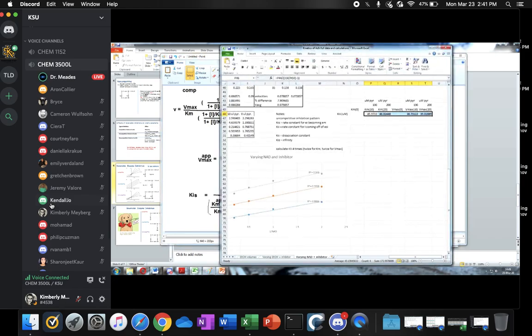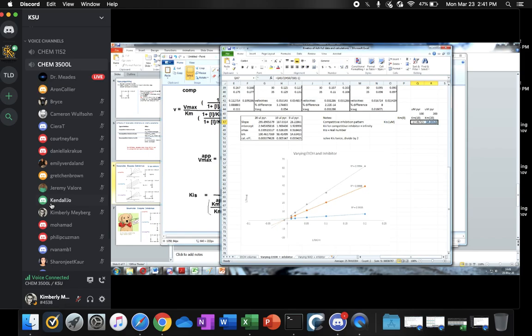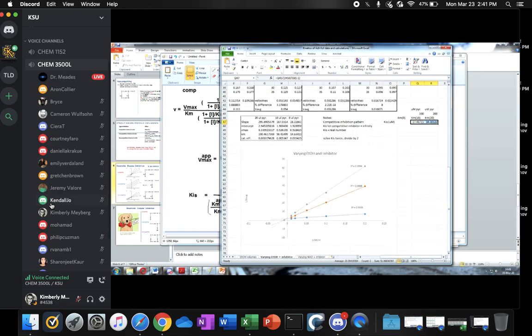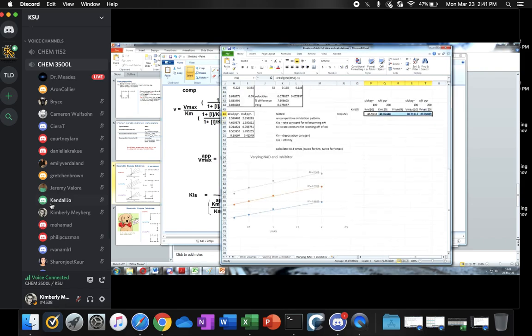So for the first one, I'm going to average these two numbers. It's only two I can get. And for the second one, I'm going to average all four. So this one will give you something like 43. This one should give you something around 26. Well, I don't know, yours might be different, but for this one, you're using the data I gave you. It's also true that when you calculate it in one way, they tend to agree more with each other. The other also agree internally.